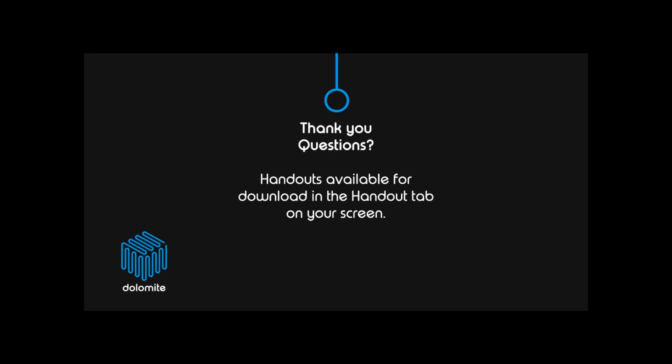I would do a little bit of research around that, narrow it down to 3 or 4 candidates for each, and carry out a design of experiments where you can easily detect very early on where your key trends lie.